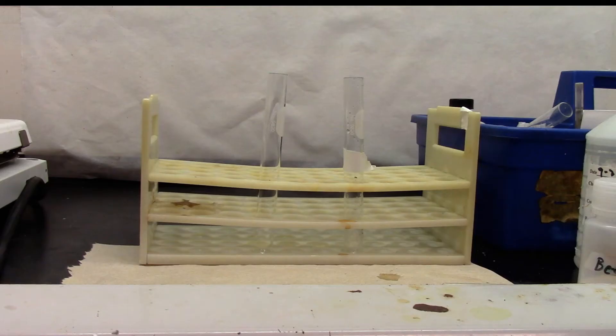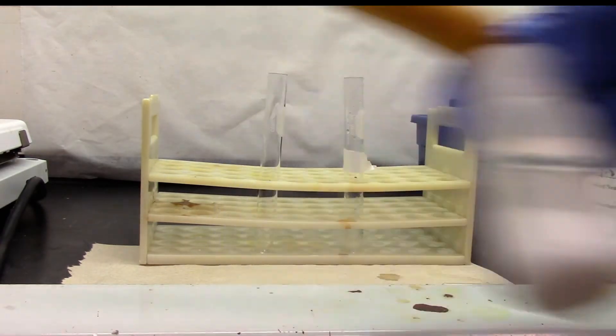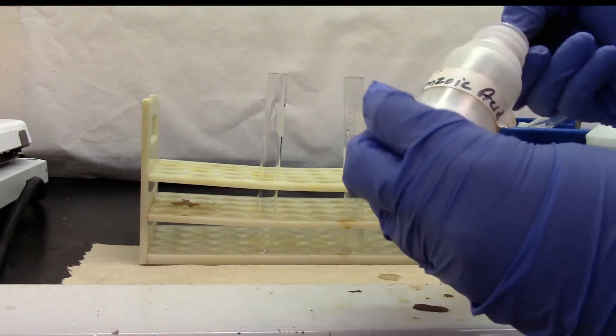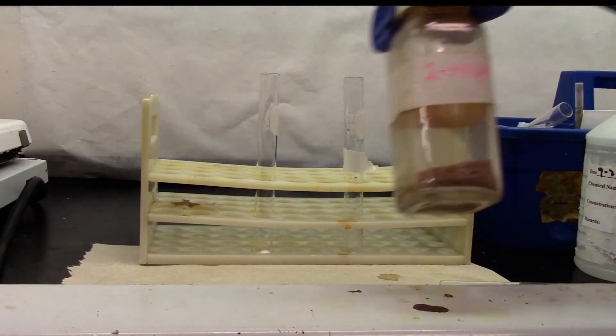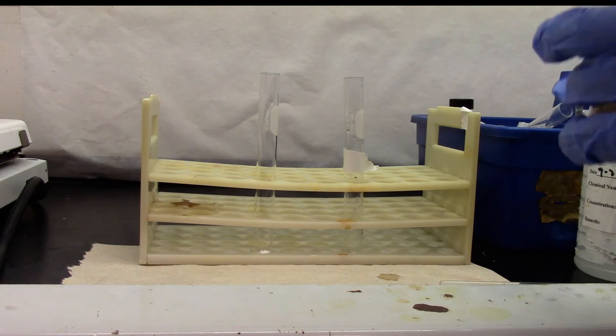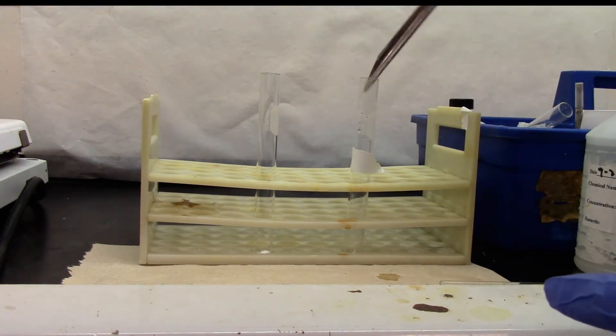We will be doing solubility tests for carboxylic acid. Benzoic acid is my sample. I will add a pinch of benzoic acid. 2-naphthol is my negative test. I am going to add a pinch of beta-naphthol.